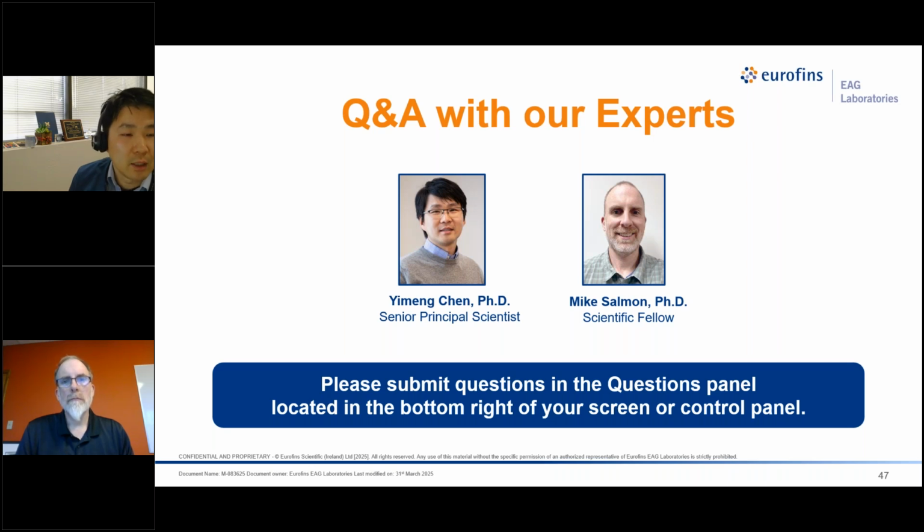That's an option. And also remember that atom probe is a destructive analysis, so any damaged region on the surface will be first evaporated at the initial stage. So we can rely on the gallium concentration to exclude the region that has received gallium implantation and use the clean or pristine region later collected during the analysis.